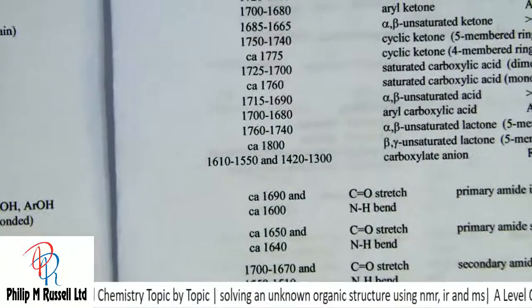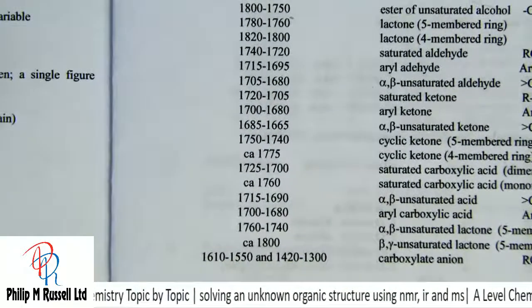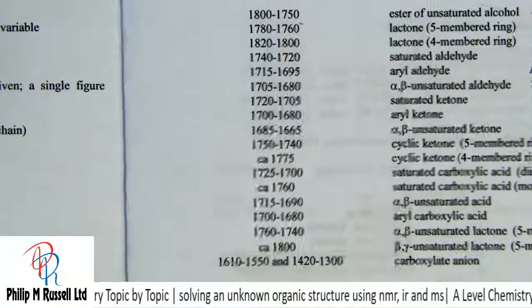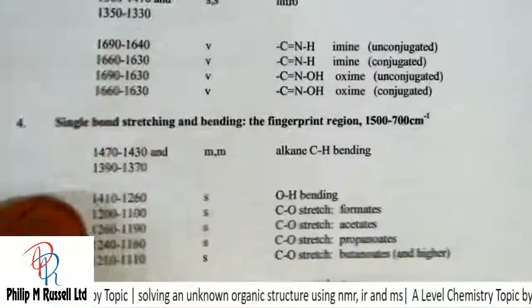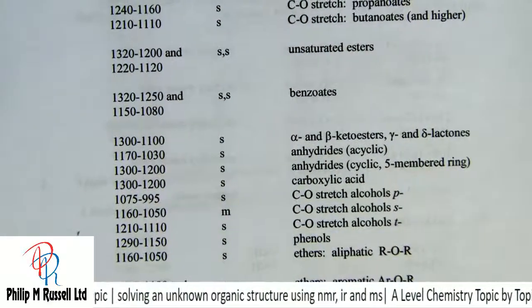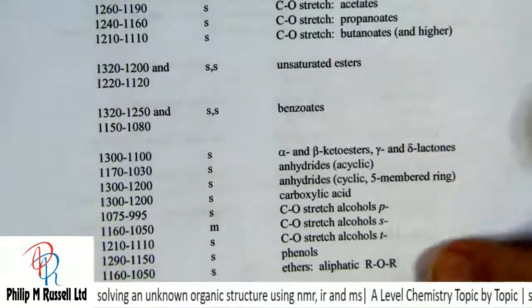Quite a broad peak, not a sharp spike. Probably a little bit lower, maybe on the next page, because there are a lot of pages to go through. There we go, about 1,000. Oh, got a good 1,000 down this way.